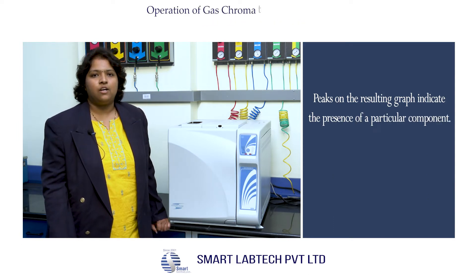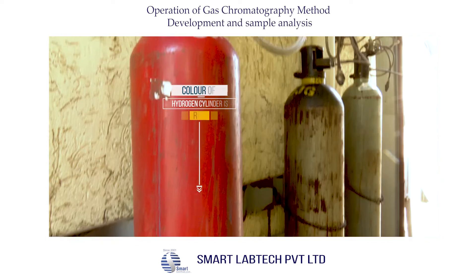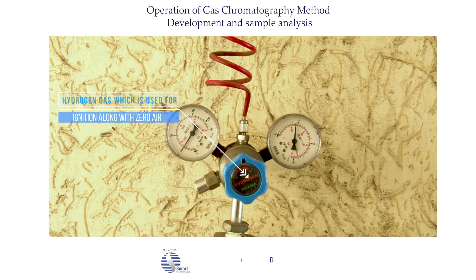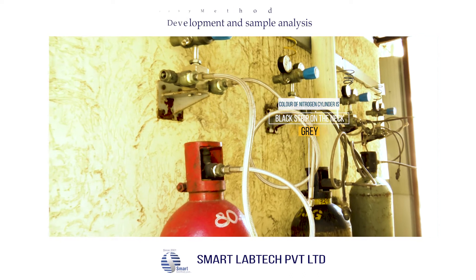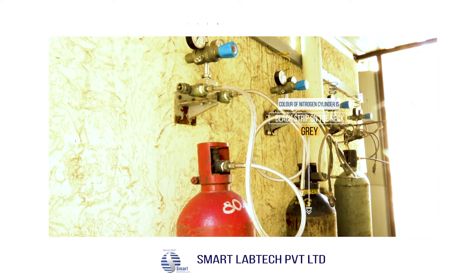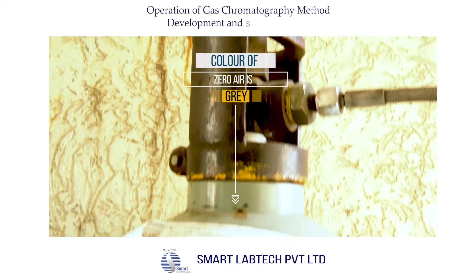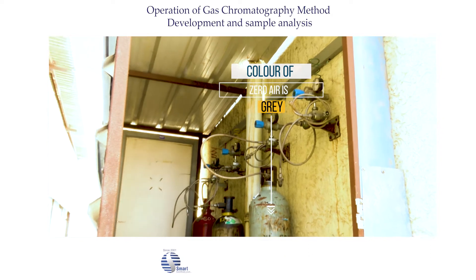These are the gas cylinders required for gas chromatography. The color of the hydrogen cylinder is red — hydrogen gas is used for flame ignition of the FID detector along with zero air. The color of the nitrogen cylinder is gray with a black strip on the neck — nitrogen is used as carrier gas as well as makeup gas. The color of the zero air cylinder is gray, and it is used for ignition along with hydrogen gas.